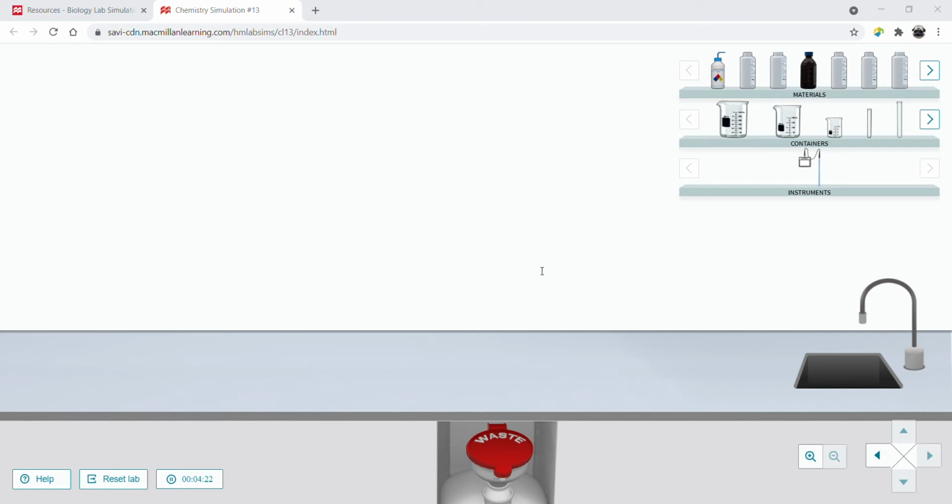We're going to take the pH meter and place it in the first test tube, and we're going to repeat that for 2 and 3. You're going to want to record those in Table 1 here on page 3. Table 1, pH recorded with a pH meter. So let's go ahead and do that.